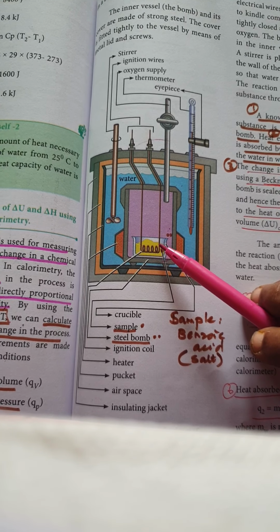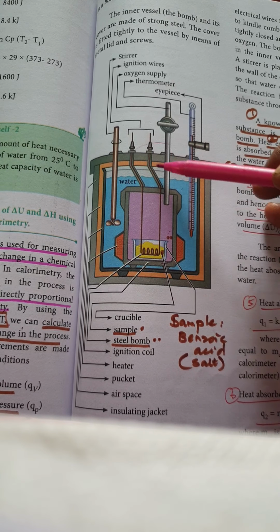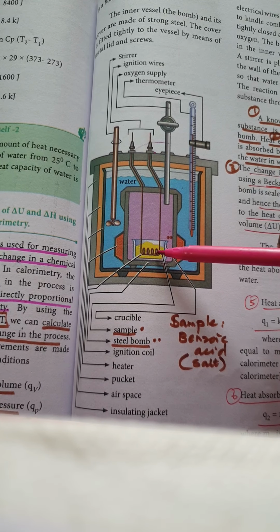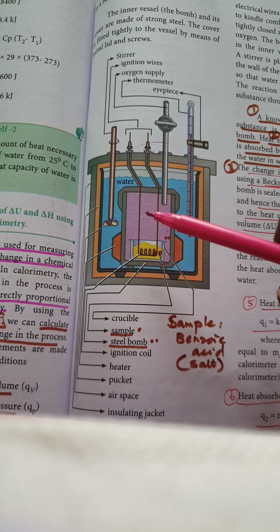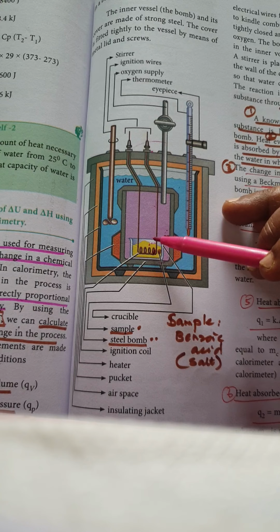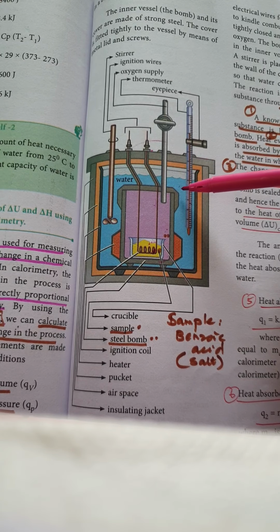I'm not going to use the heat energy as such from the gas stove, but instead I'm going to use two electric wires which are connected to a filament, and when the wires are connected to the electricity, the filament glows and heat energy is produced, and due to the heat produced from the electrical energy, the sample is going to burn. And when it burns, it takes up the oxygen which is present there, and it gives out a large amount of heat energy.